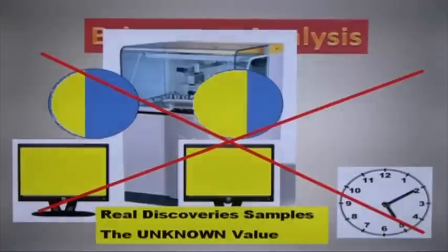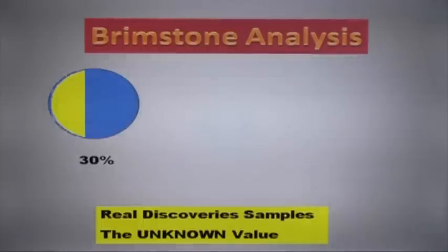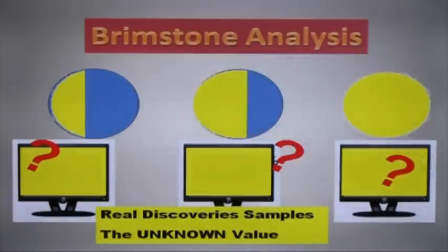The test is abandoned. There's obviously something wrong. Three new samples are prepared. It takes another two hours. You probably have a bunch of scientists ringing their wives saying, we're going to be home late. So once again, the analysis begins. The machine looks at the 30% slide. It says, no, I can see a lot more than that. In fact, it goes off the scale again. It looks at the 60% and says, no, I can see a lot more than that. So it looks at the 100% and says, yep, I can definitely see 100% or more.